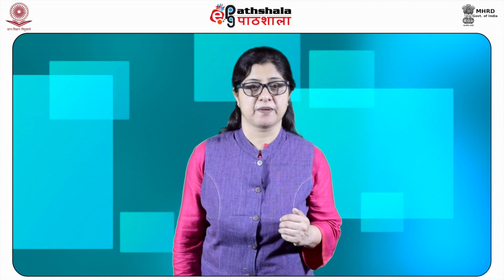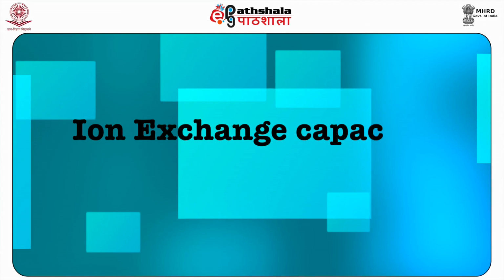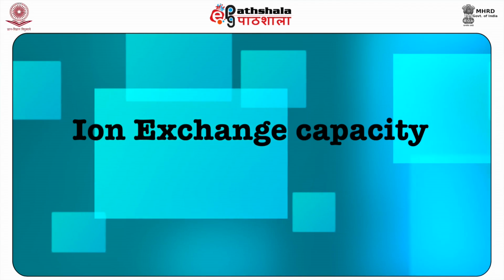The concentration of the participating ion of the opposite charge also plays an important role. The retained ions can be eluted with the aid of a high concentration of cations or anions without changing the pH and hence the dissociation relationships. Ion exchange capacity. An ion exchange capacity of a resin may be characterized by the number of ion active groups.